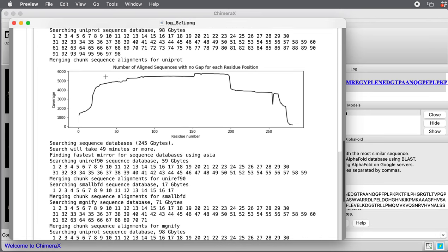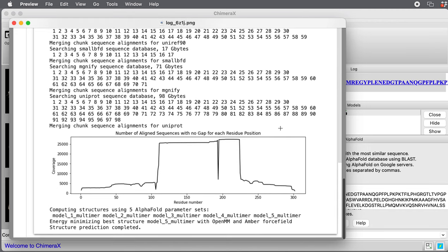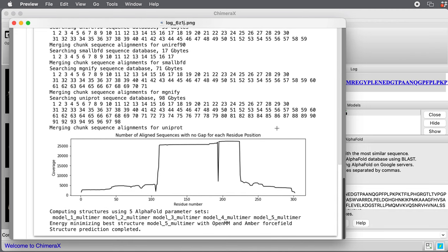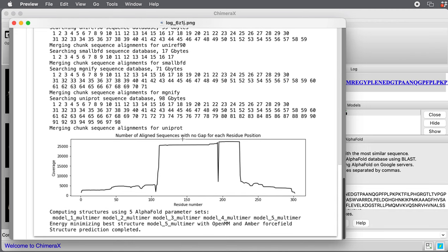It then does the next protein. This one, it found five or 6,000 sequences in the middle, less towards the ends. And the third protein, it found 25,000 sequences in the middle, but only a few thousand at both the N-terminus and C-terminus.